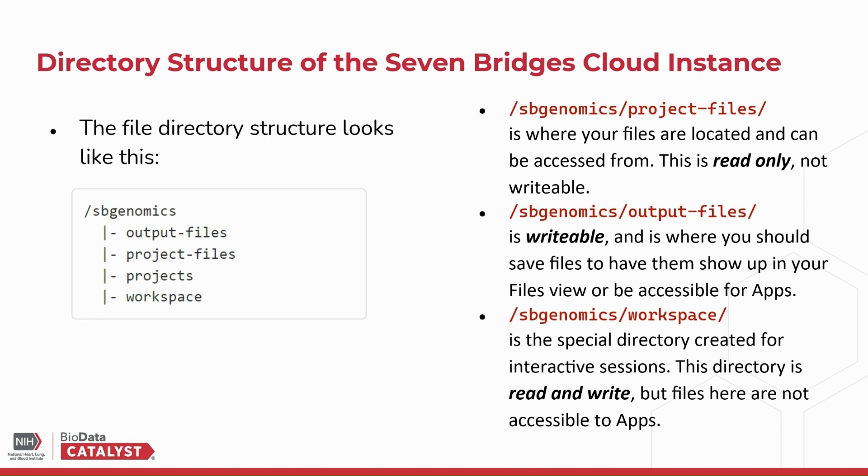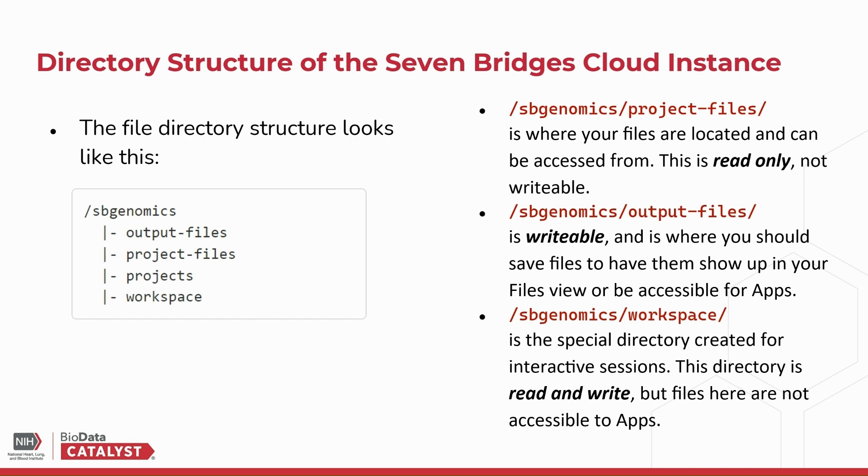/sbgenomics/workspace is the special directory created for interactive sessions. This directory is read and write, but files here are not accessible to apps. The files here are directly accessible to the Data Studio session. This fourth directory that I didn't mention, projects, actually leads to the same location as project-files, but by a longer file path, so the project files directory is provided for convenience.